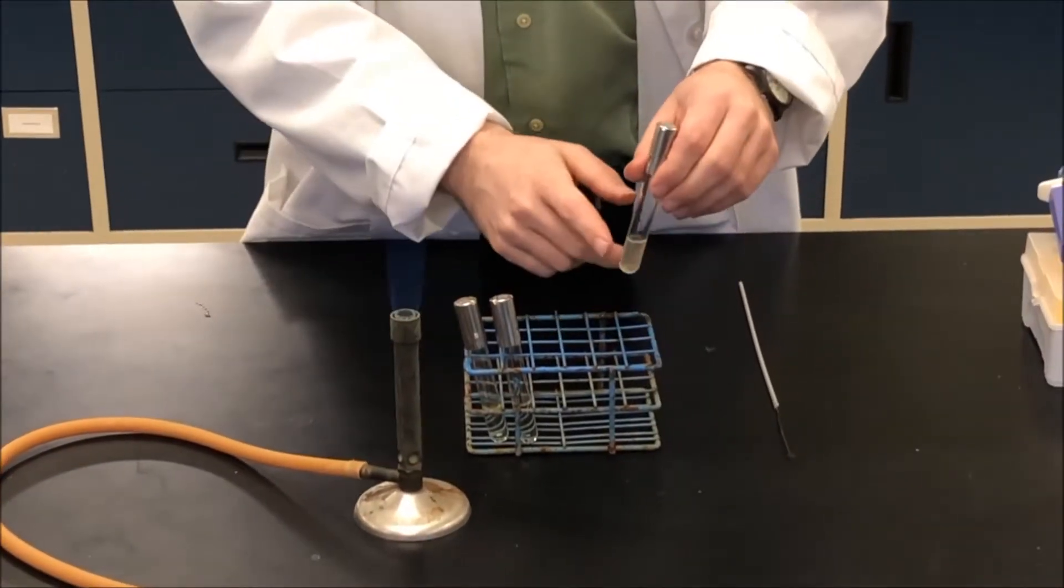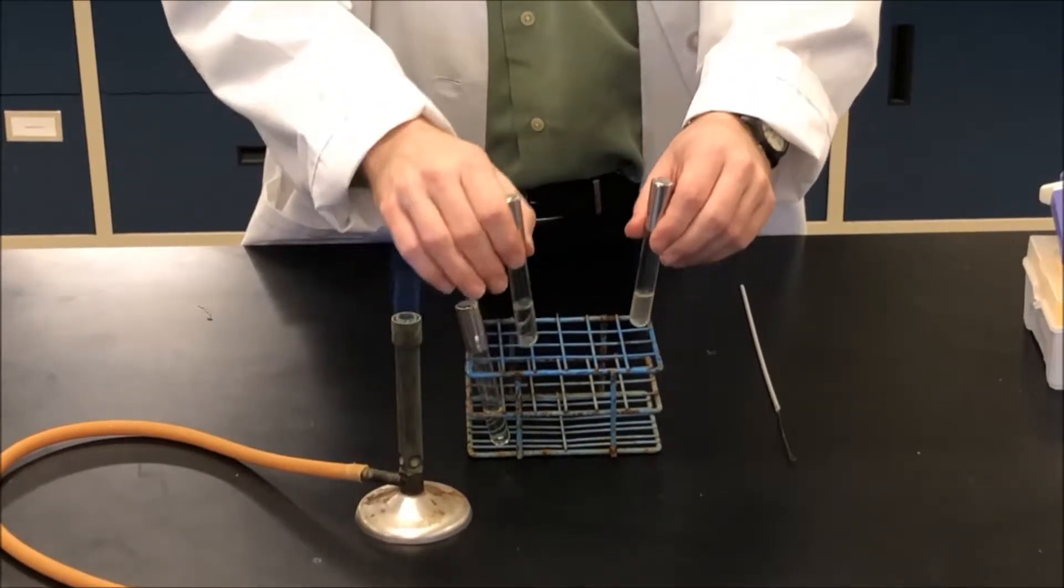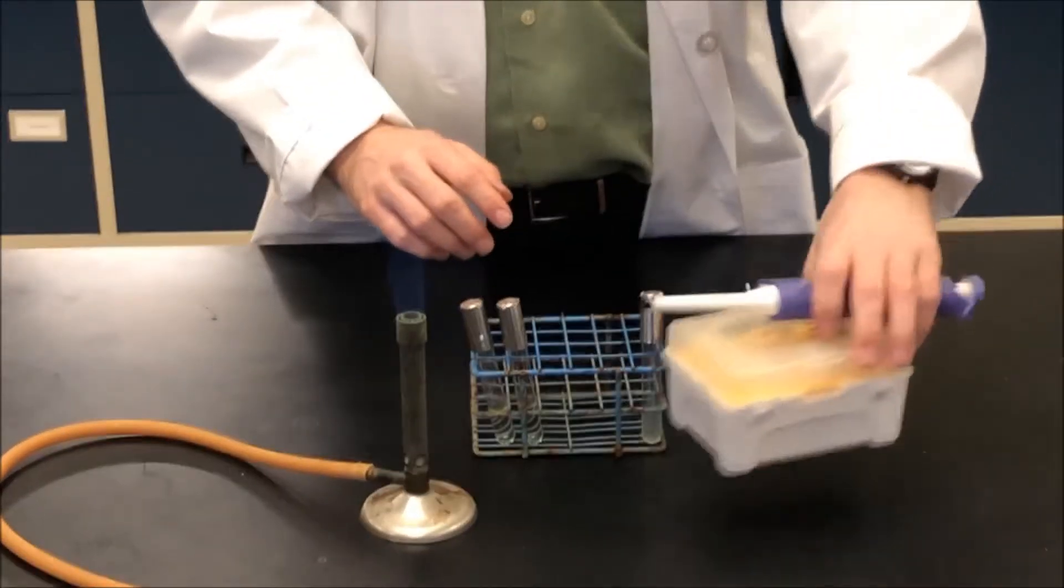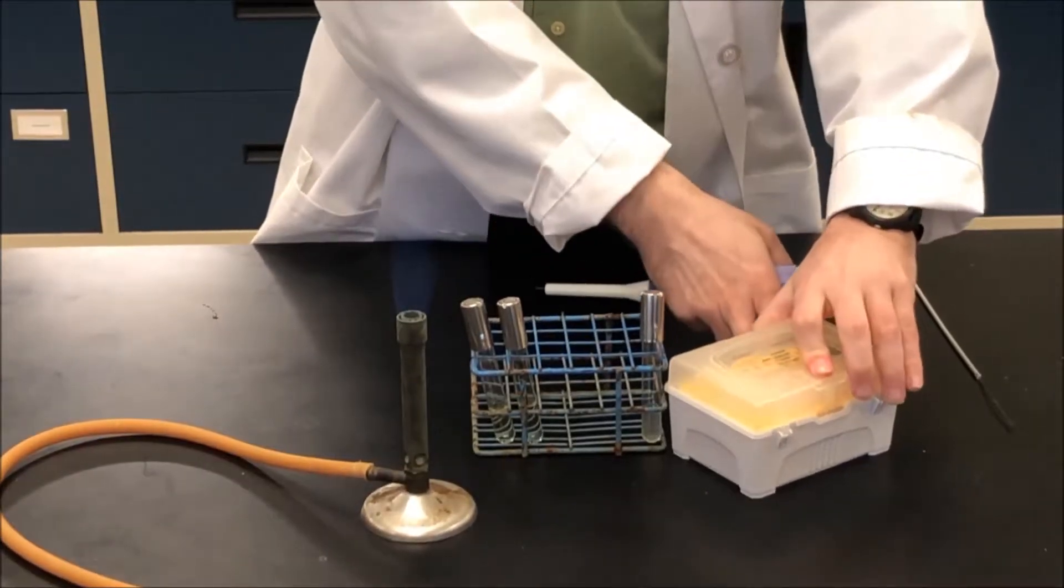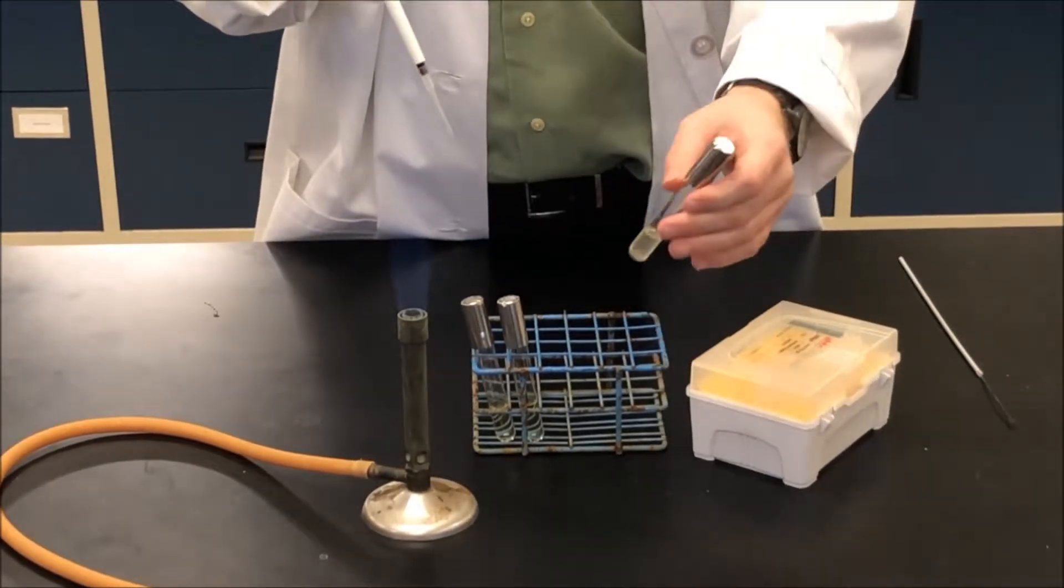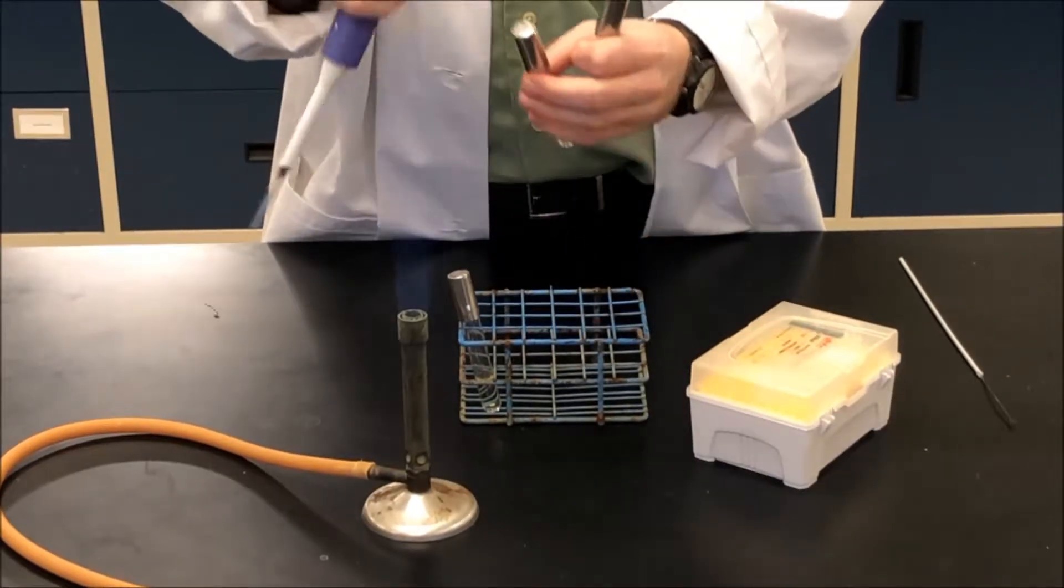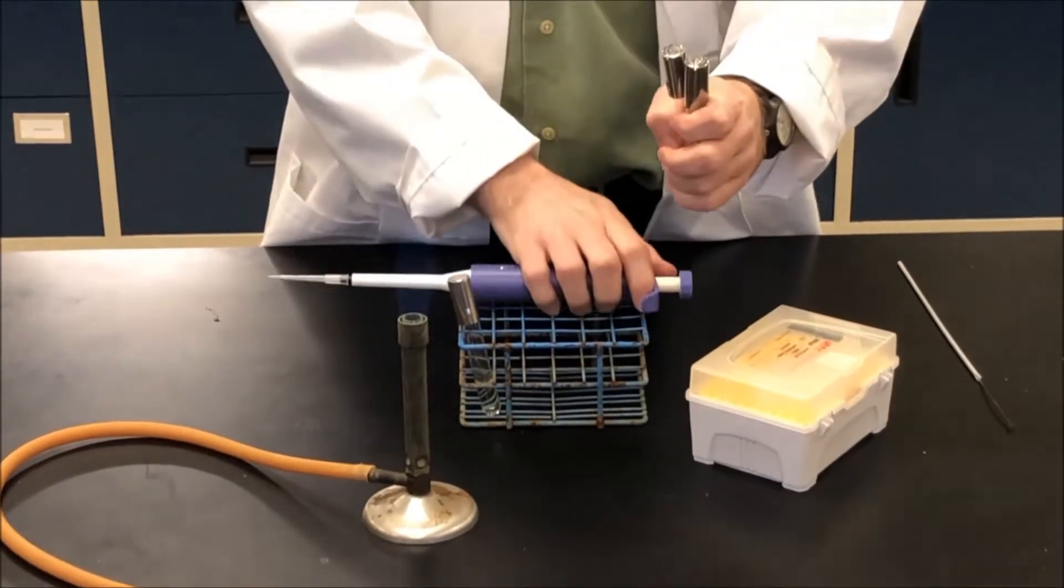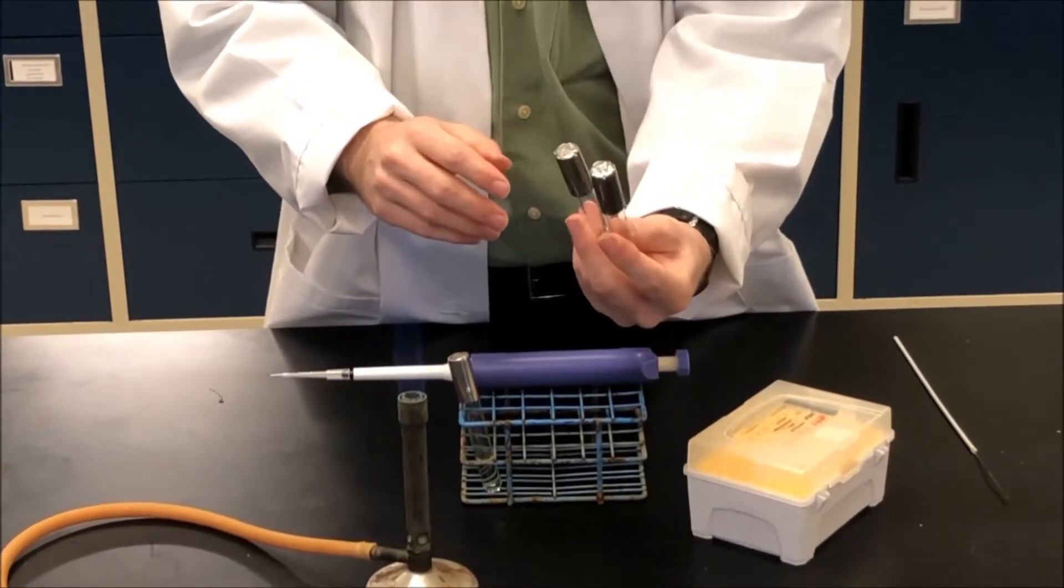Now there are two ways that I can transfer some of this liquid culture into my sterile media. One way is by using a micropipetter. So I can take a tip as such. I take my tube of bacteria and I take my sterile tube. I'm going to hold them like this, both tubes.